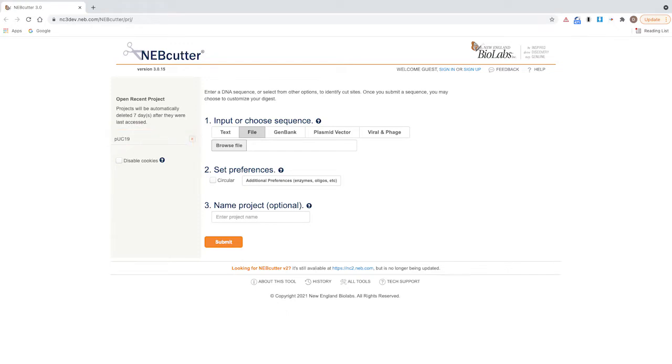You can designate if your DNA molecule is linear or circular. If your sequence is circular, please select circular.